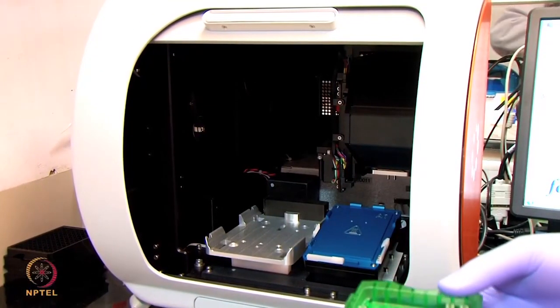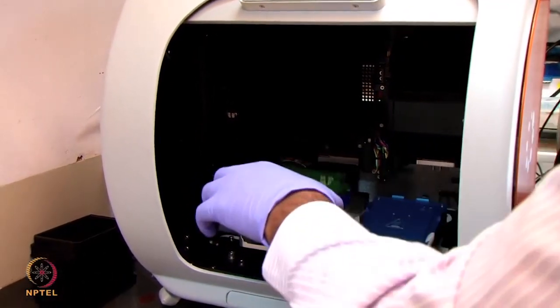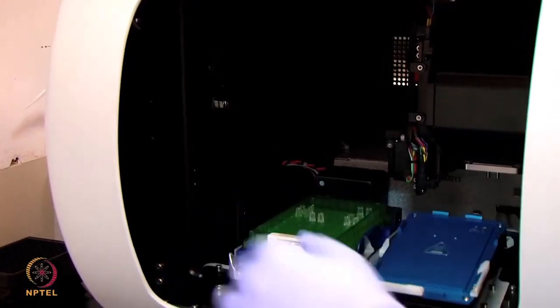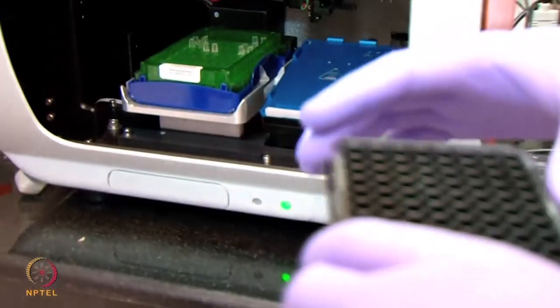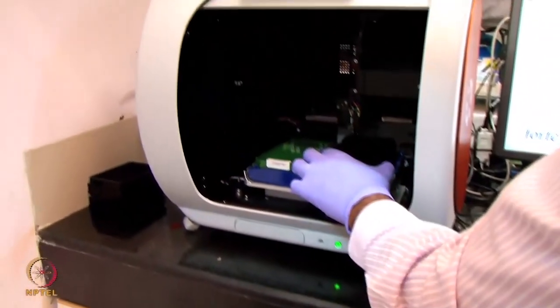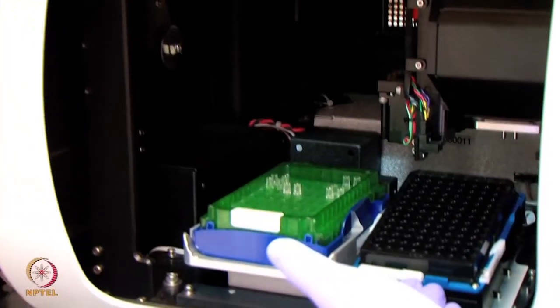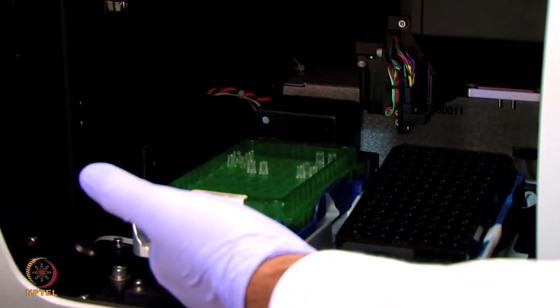Now the sensors are hydrated. I am going to place them in the instrument. The sensor holder I am placing here, like this. It should be firmly fixed in the groove. And now I am going to put the sample plate which contains the biotinylated antibody, I am going to place it like this in the sample tray. This particular part we call the sample compartment. This part we call the sensor compartment.